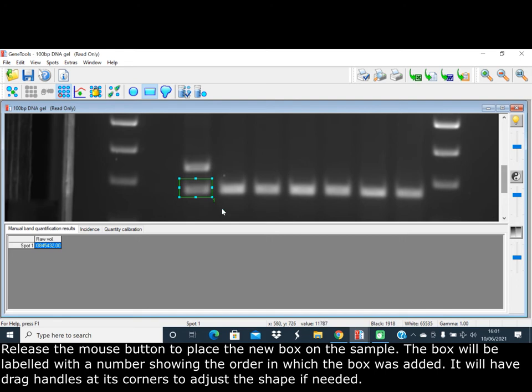The box will be labeled with a number showing the order in which the box is added. It will have drag handles at its corners to adjust the shape if needed.